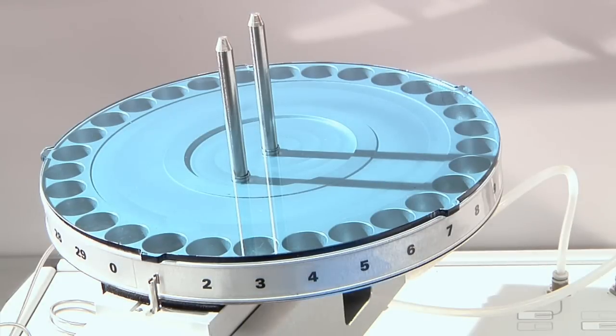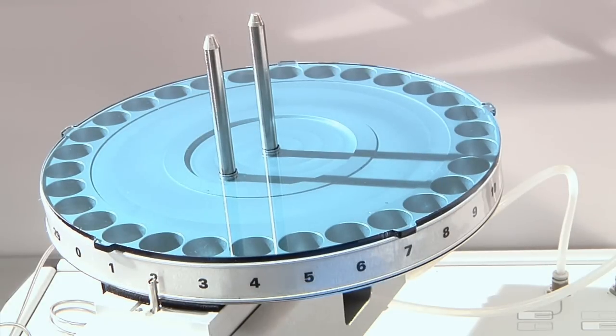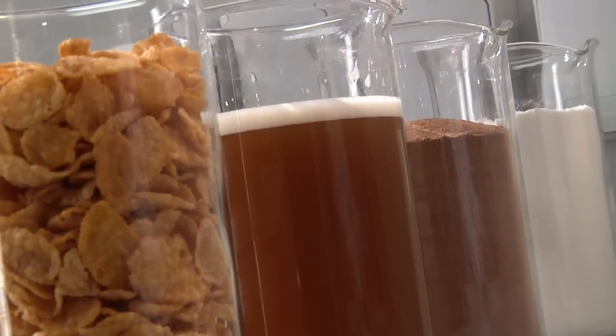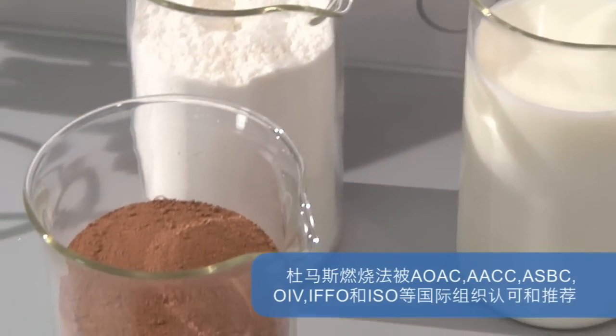Simple and fully automated, the VELP Dumas Nitrogen Analyzer is ideal for numerous applications such as food, beverage, environmental, chemical, and pharmaceutical testing.